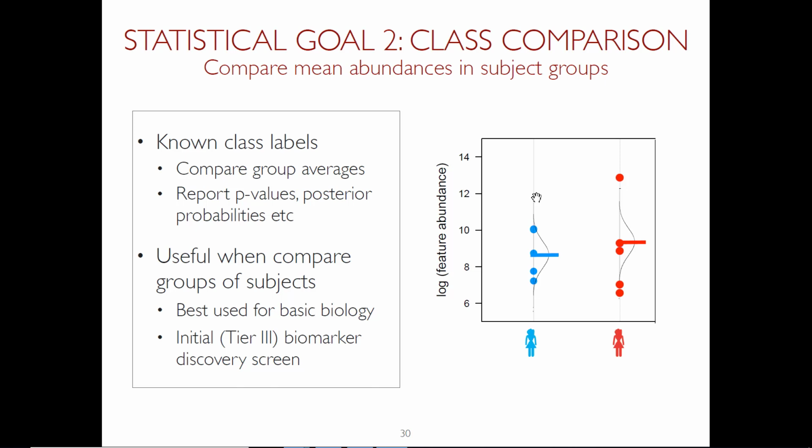So for these 2 weeks, we're actually focusing on this goal 2, because this is the most common goal. And usually we would do this in proteomics as part of screening or initial discovery experiments, because proteins which are differentially abundant may be good candidates for predictive proteins and good leads for follow-up, for example, with targeted methods like we discussed just before with Skyline, right, and so on. But these are by no means conclusive statements if we want to do biomarker discovery.